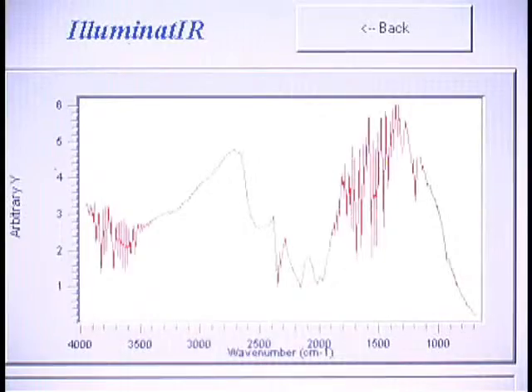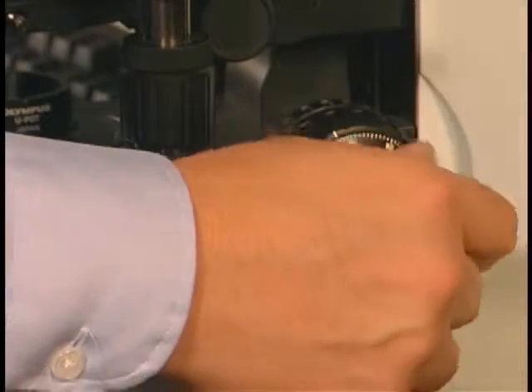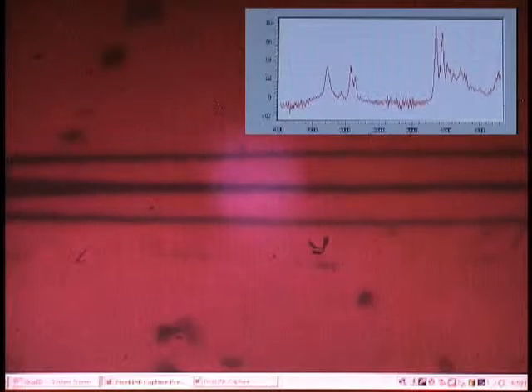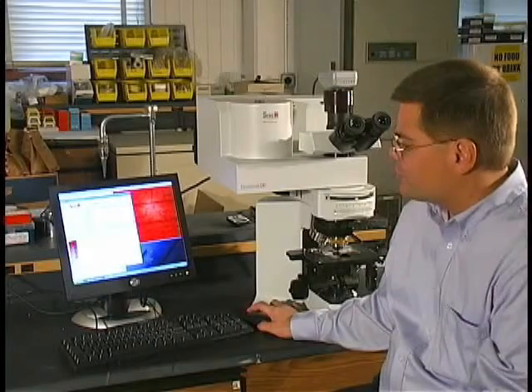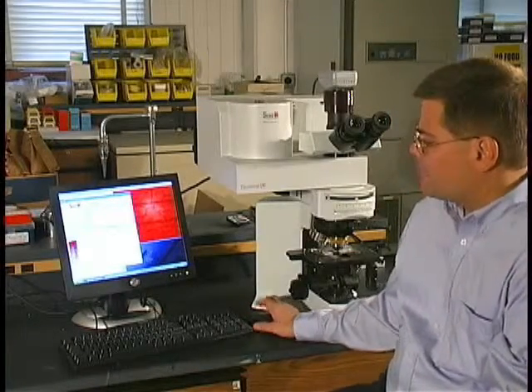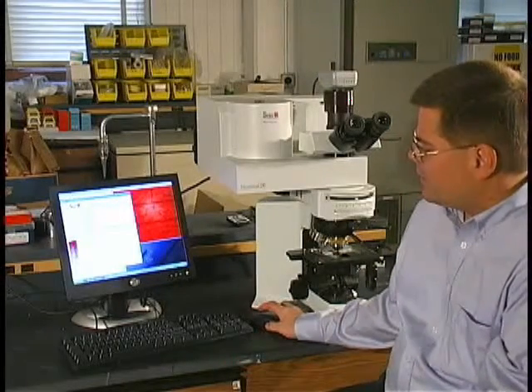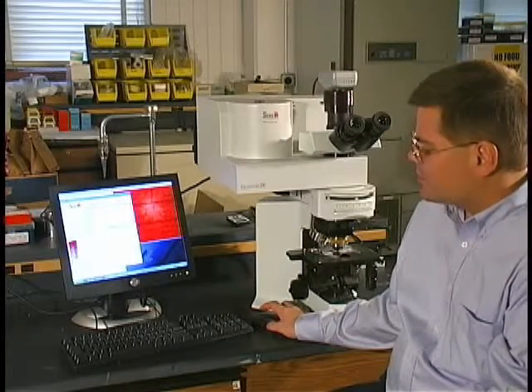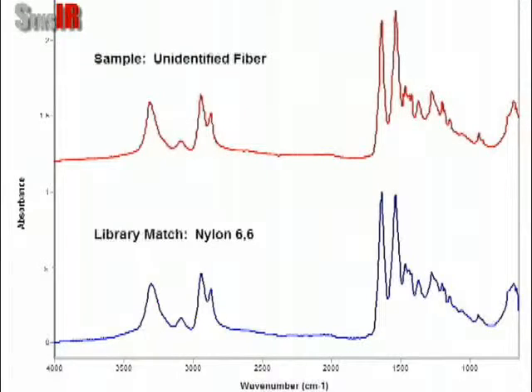We can safely collect the background without concern for contamination from the sample itself. Once the background is collected, we hit sample analysis and then raise the stage. As we raise the stage, we see the fiber first come into focus. As soon as contact is established between the Diamond ATR element and the sample, the spectroscopic bands appear and you can start your analysis. Once the 16 scans are collected, the data is compared with the library, which reports that this fiber is a nylon fiber.